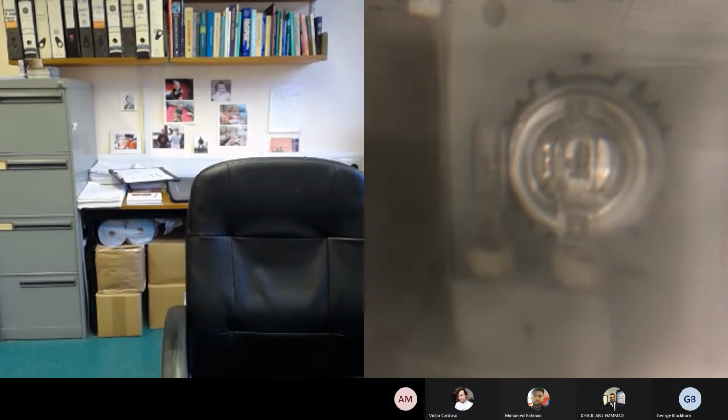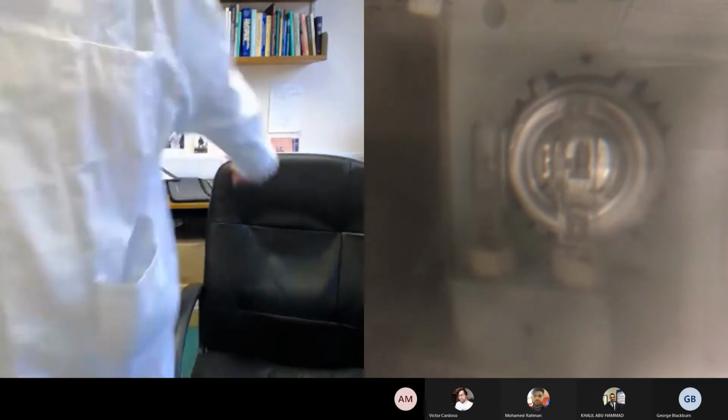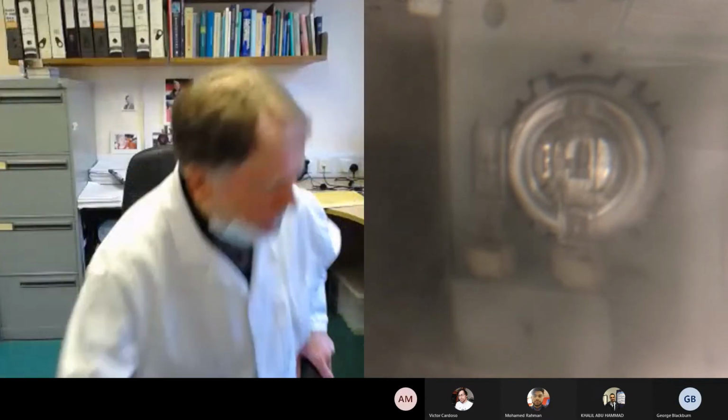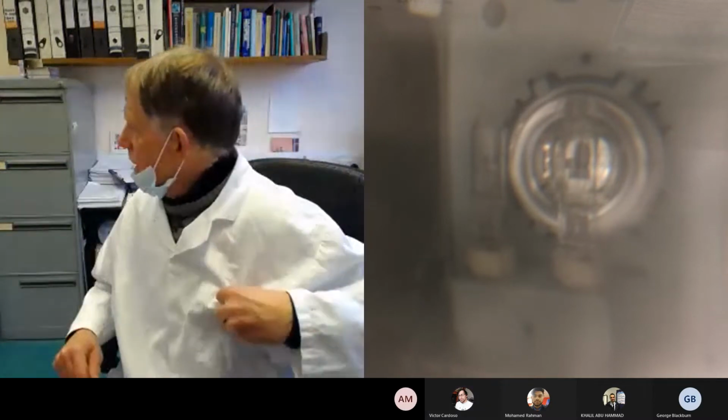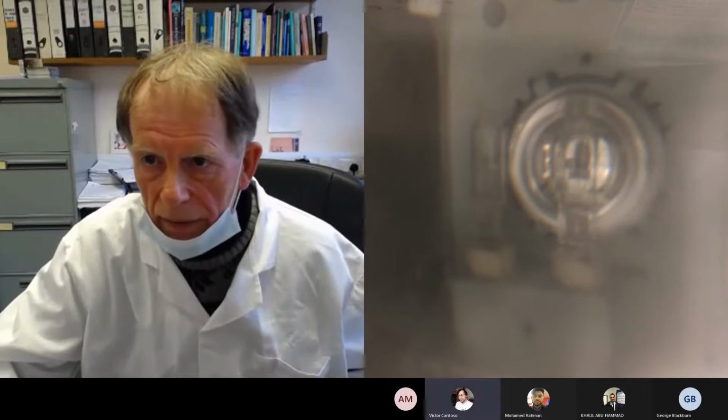Thomas, what was the concentration? What was the concentration? Yeah, I'll do it now myself. Right, let's get a pen. I'll just check the concentration myself, then we'll move on to you. Give us about 2 minutes, okay? Do you need a calculator? No.